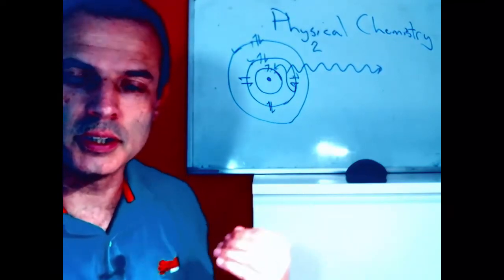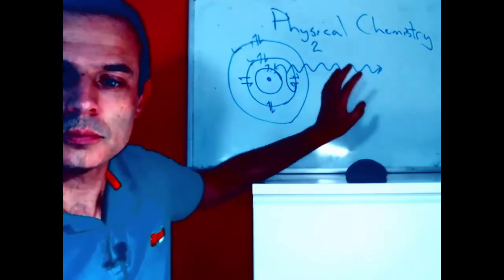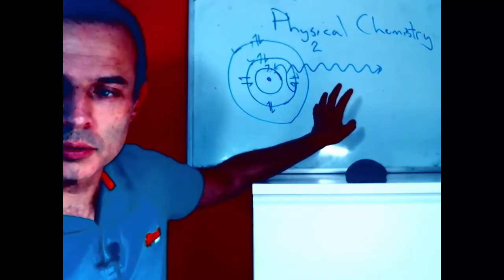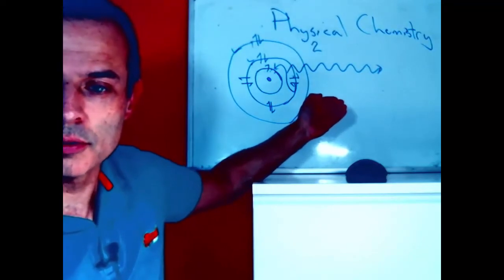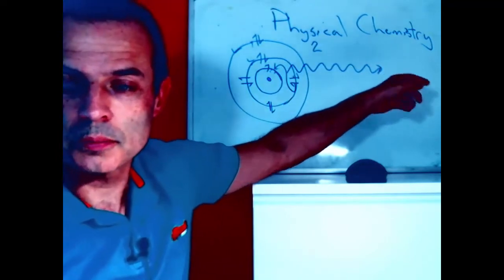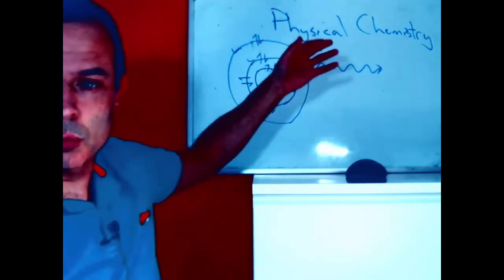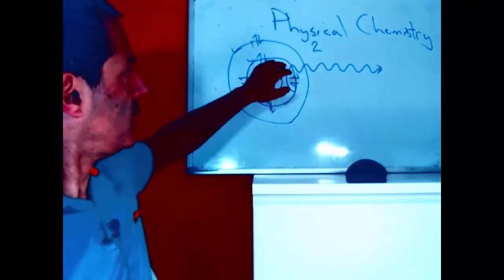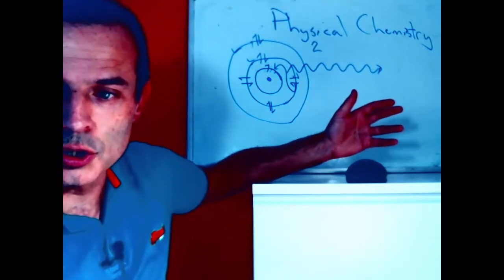Because this particular technique measures the difference in energy between two core energy levels, it tells us very quickly which element we're talking about. Why is that interesting? Well, the one that we had before, X-ray photoelectron spectroscopy, where we measure the energy of the electron that comes out, if we bond these electrons, the outside ones, to something else, that will change the level of the core electrons as well. They will be shifted slightly, and so we will get an energy shift.